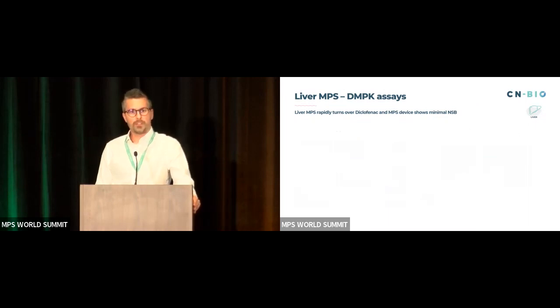So then we really wanted to understand, can this be used for key contexts of use that the pharma and drug development industry cares about? And so we chose two different areas to look at. The first one being DMPK and pharmacology, and the second one being safety, pharmacology, and toxicity.